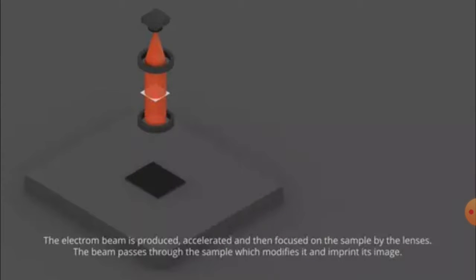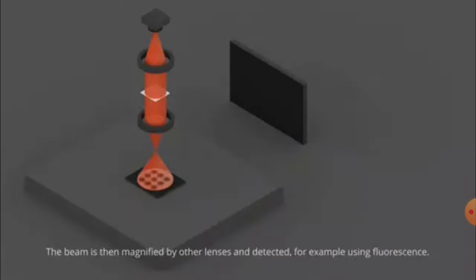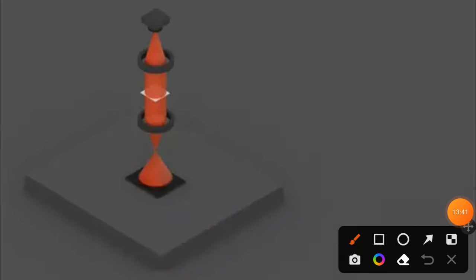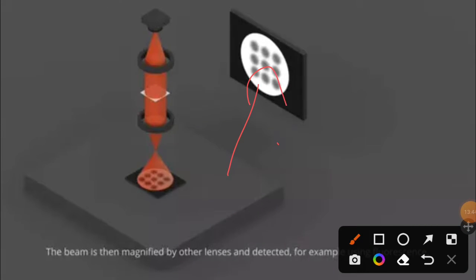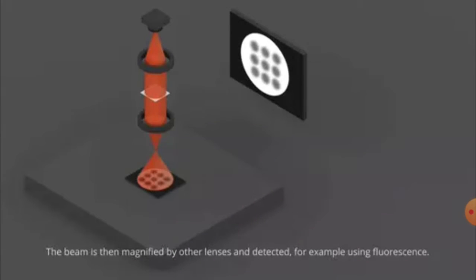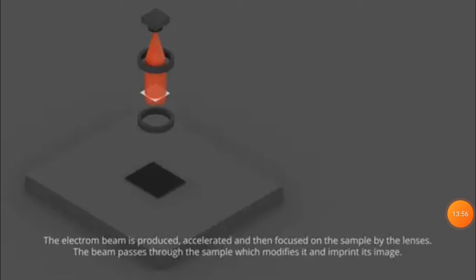And it also tells you information about the compound and element structure. But the disadvantages are, as you can see in this GIF again, that the images are still black and white. And another important disadvantage is that it is too costly and large. A proper housing and maintenance is required, and in turn it only gives you a 2D image, okay.